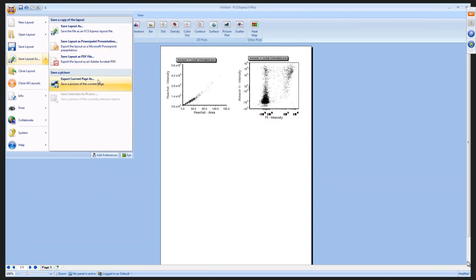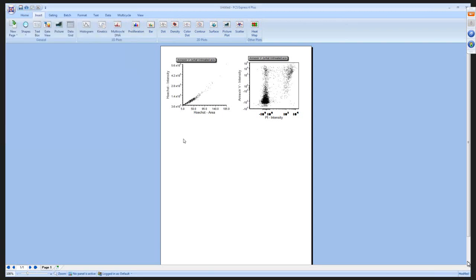And I'll show you, once we set up a little bit nicer of a template, how we can actually export these things very easily. So one thing that you're used to doing in the ChemoMetec software is setting up some gates, and how we do that. We have a gating tab up here. We have all these familiar type of gates.